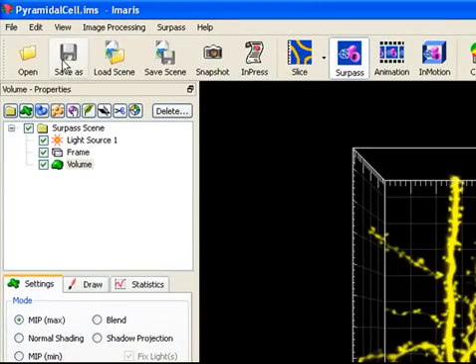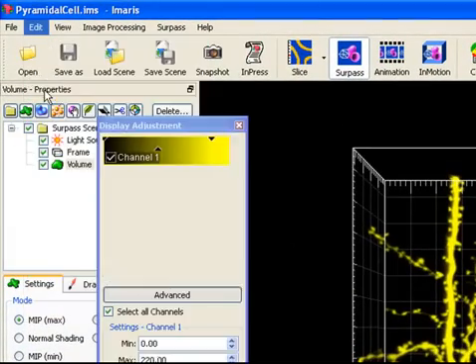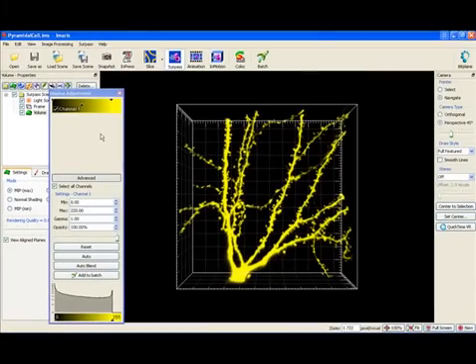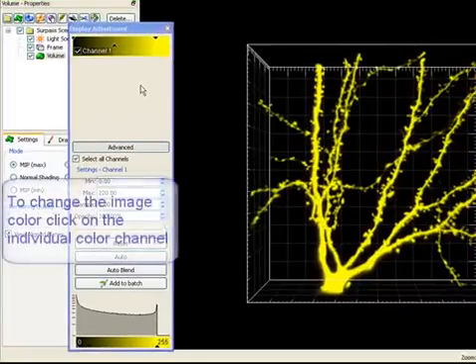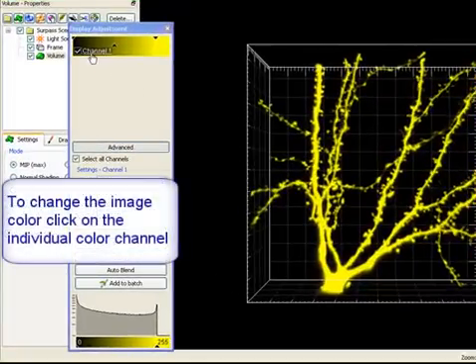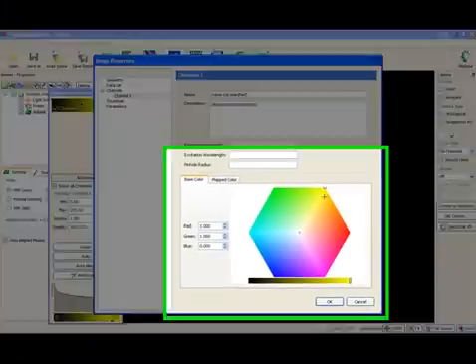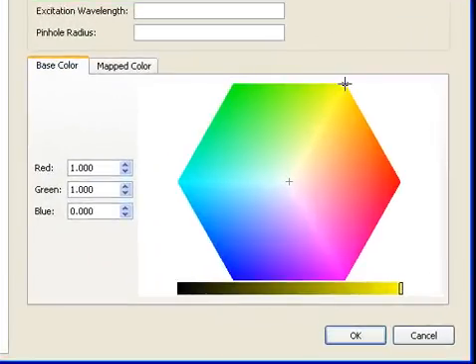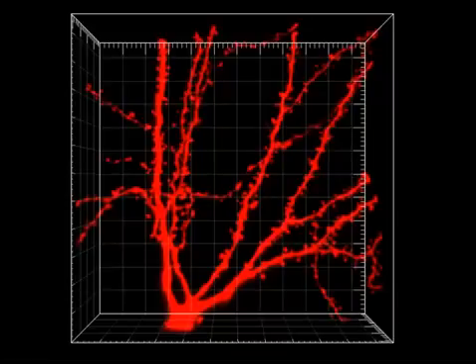Now how to alter the colour of the display. In the edit menu select the show display adjustment option. Click on channel 1 to open the colour selection. In the colour table select and adjust the colour and click on OK. This is the result in the viewing area.